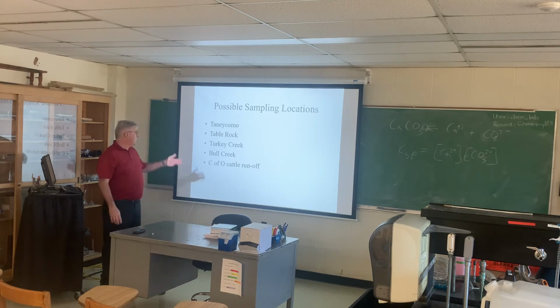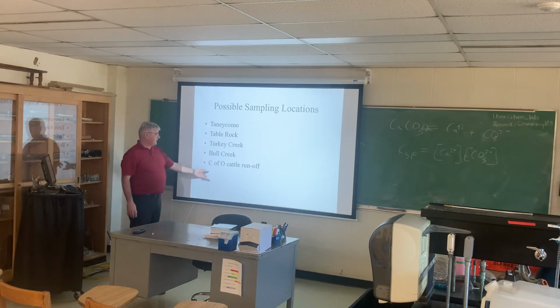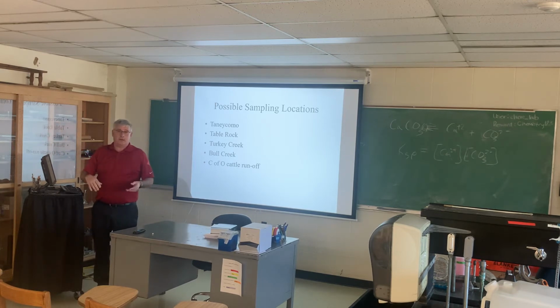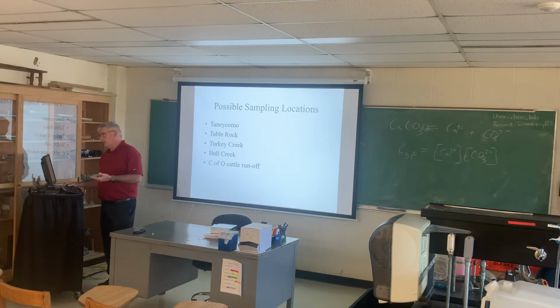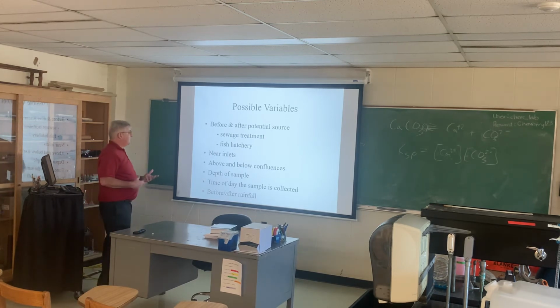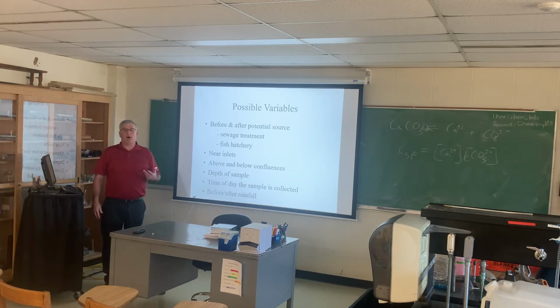This is just giving you some ideas that are local: Taneycomo, Table Rock, Turkey Creek, Bull Creek, cattle runoff, the dairy stream, the lake. You can get to Taneycomo very easily from campus. So all of those are possible sampling locations. I know with COVID this is going to be kind of strange this year, and we'll have to see. Everything may be on campus this year, but it's possible that you have group members who are commuters, and they may be able to grab off-campus water samples and bring them back for your group to sample.